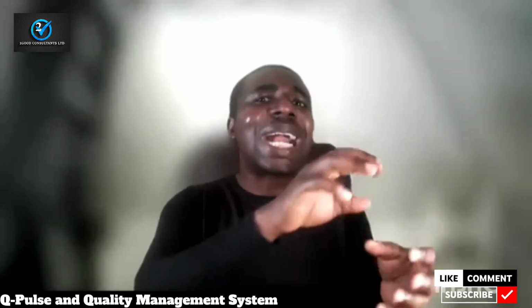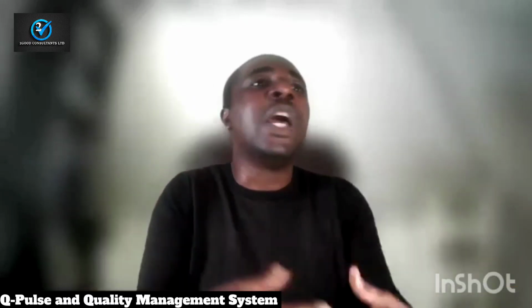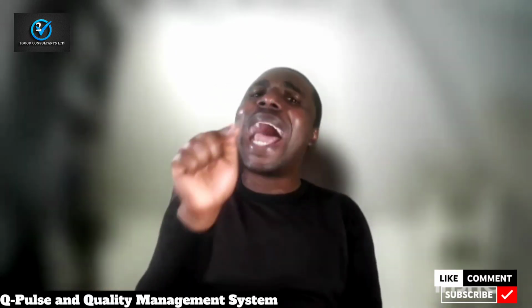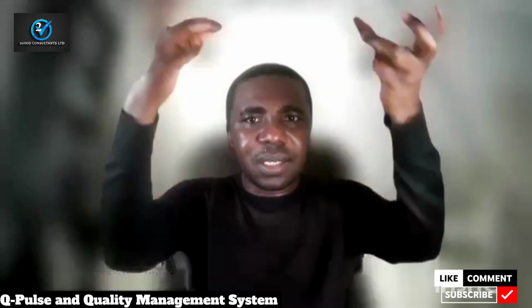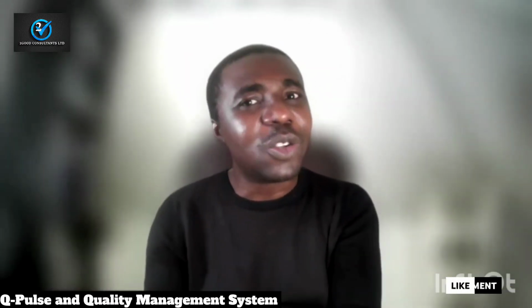Now, you know that CAPA has processes, which we are going to discuss anyway. There are processes that are involved. It's not just about saying something has happened. Most times, as a manager or as a senior personnel, you must be able to track where we are with these things we've raised. Because when you raise it, it may not be when it's going to be completed.